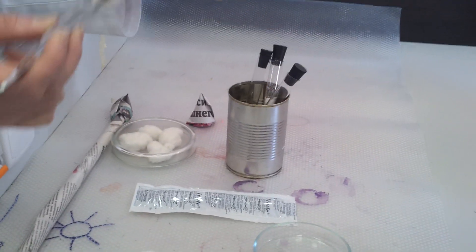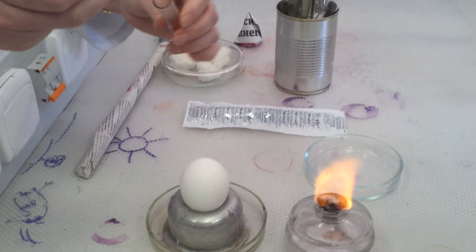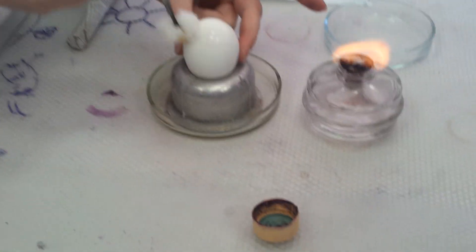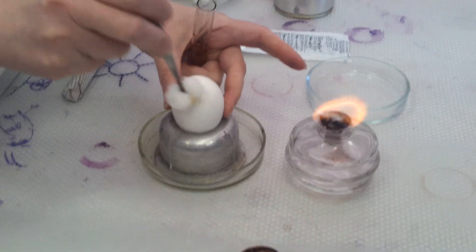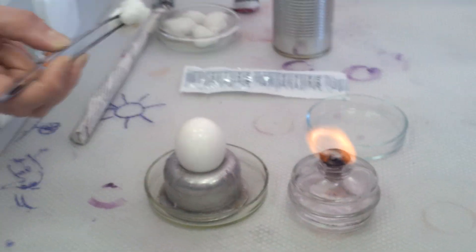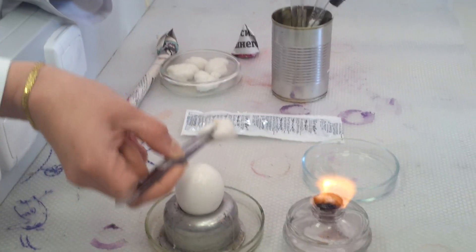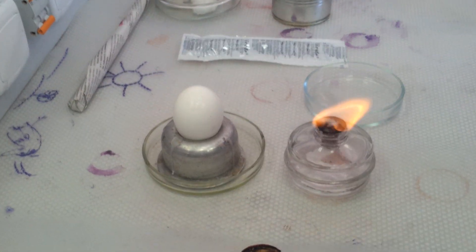An iodine solution. In a real laboratory, otherwise it will be contaminated with the microbes on the surface. In a real laboratory, they just take the flame and burn it.